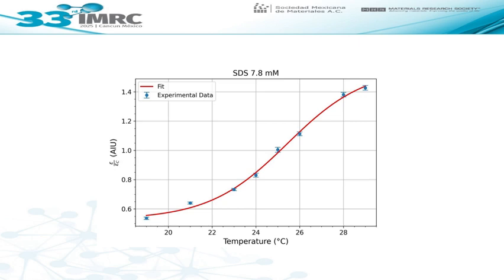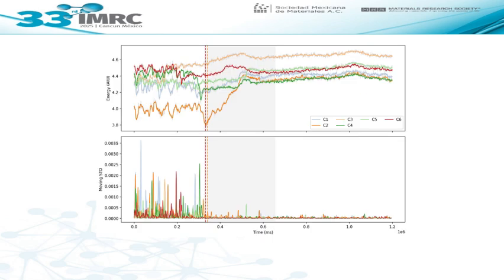Now, for the second part of our work, we measure the fluctuation of the energy emitted by our sample. This is a pretty distinctive behavior. In particular, we can appreciate two kinds of behavior of the sample. Two times close to zero.